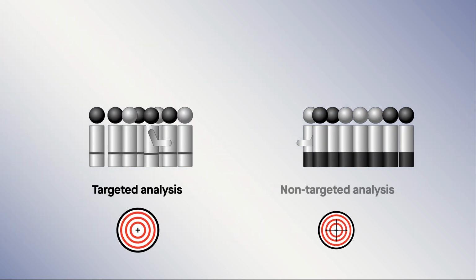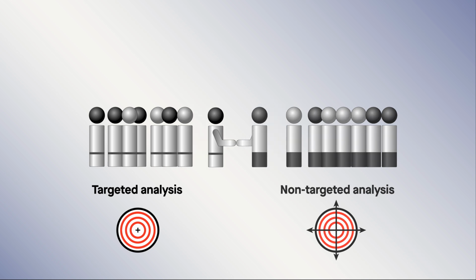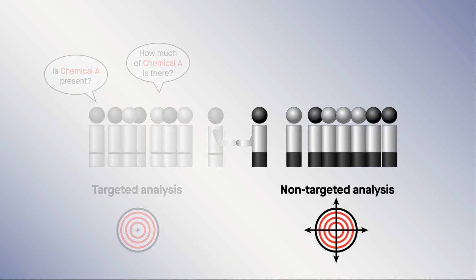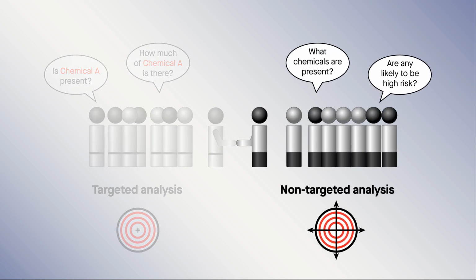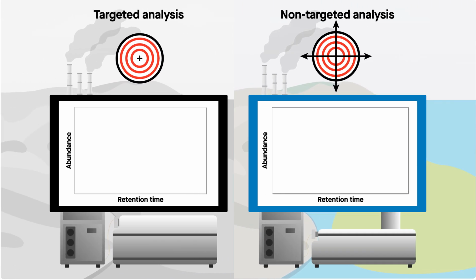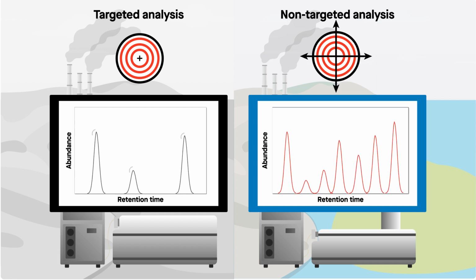Targeted and NTA methods go hand in hand. Targeted methods will always be the gold standard for quantifying known chemicals in selected samples. But NTA methods facilitate more comprehensive chemical characterization and the identification of emerging contaminants. NTA, therefore, represents a fundamental shift in the capability to detect underlying public health threats related to chemical exposures. Whether used alone or alongside targeted methods, NTA improves the EPA's ability to protect human health and the environment by better prioritizing exposure and hazard research.